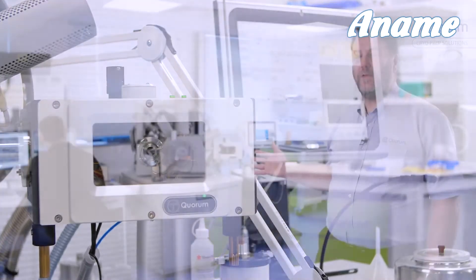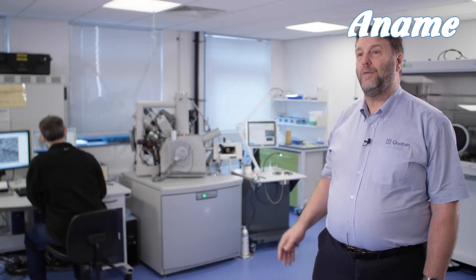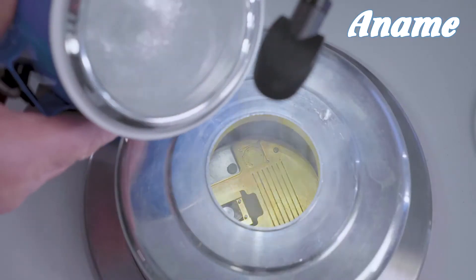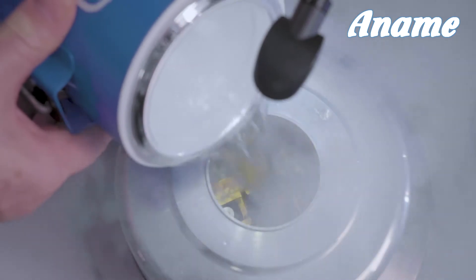The Quorum MPP3010 that you can see in the background here is an on-column gas-cooled cryo-preparation system. It uses an off-column dewar which gives you a very long hold time. The advantage of using gas cooling is that it can get to very low temperatures — any part of the system can get down to at least minus 190 degrees C.